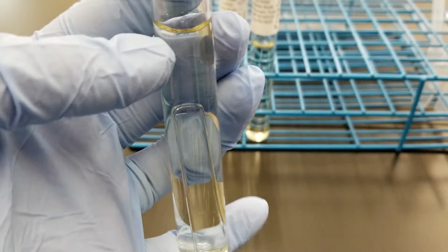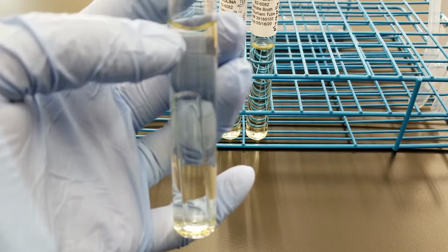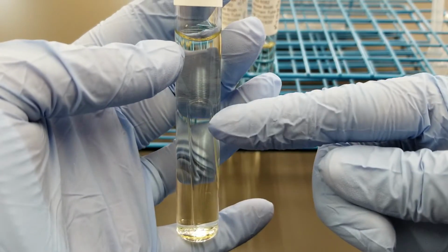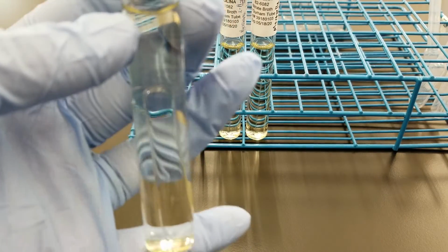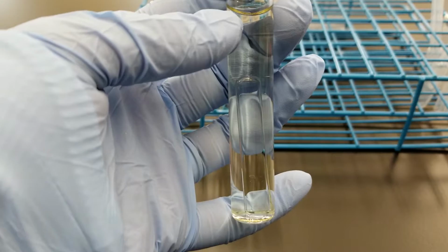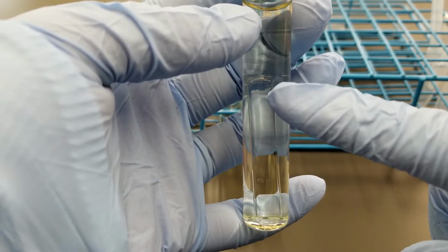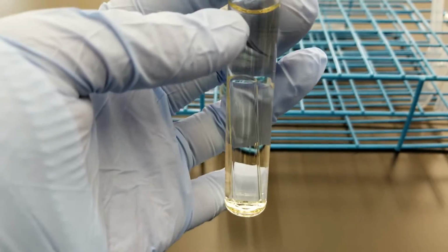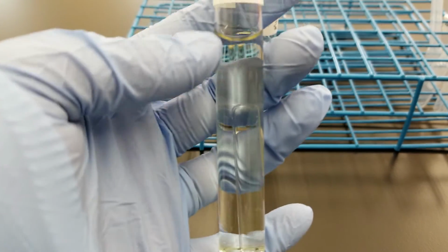Okay, and this has been uninoculated thus far. It has nitrate in the broth. And the Durham tube here is upside down to see if there is gas production by the organism after incubation. So when you're looking at inoculating your tube initially, you want to make sure that it looks clear and that there is no gas here. If there is gas here, that might be that you have growth in here that you don't realize. Okay, so this is showing that this is a good one to inoculate.